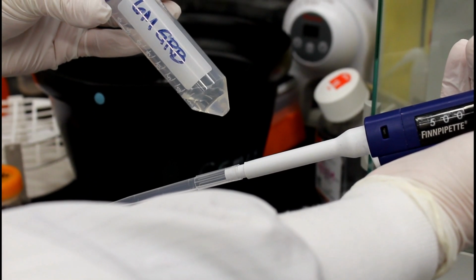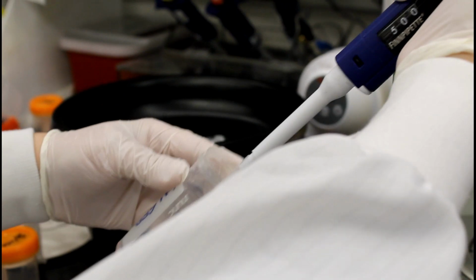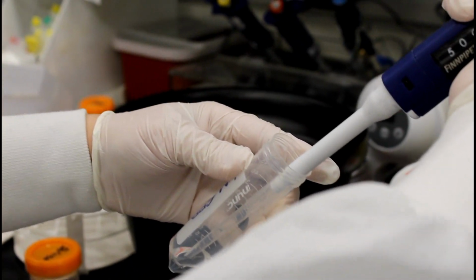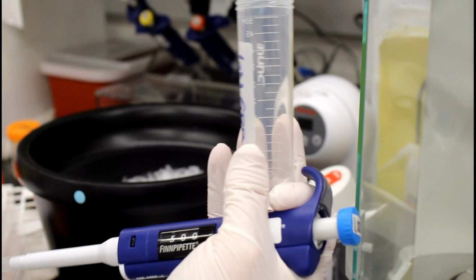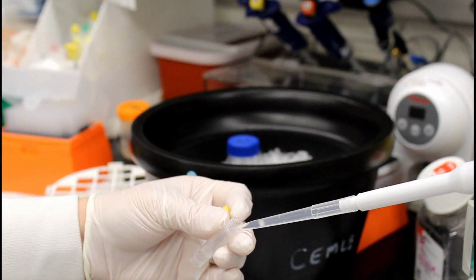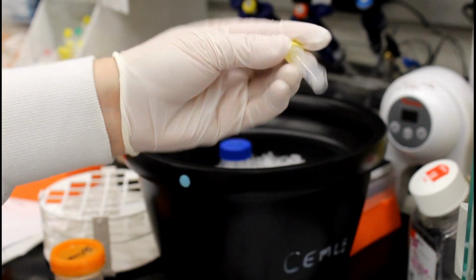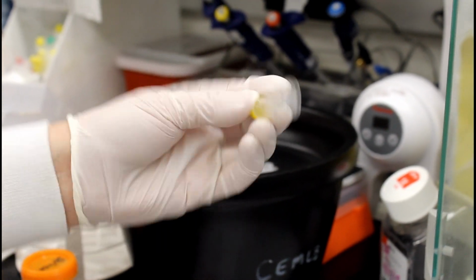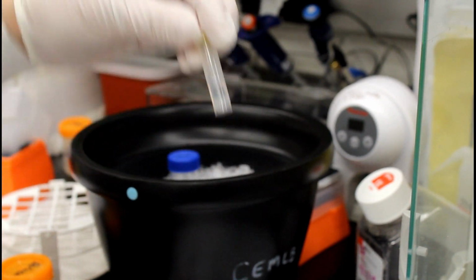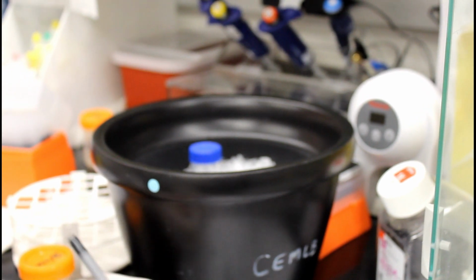Next, add a half a ml of 6 molar guanidine reduction buffer to the sample. Then mix the sample by tipping the tube back and forth manually. Once you finish that, the sample is ready to be stored at 2 to 8 degrees Celsius.